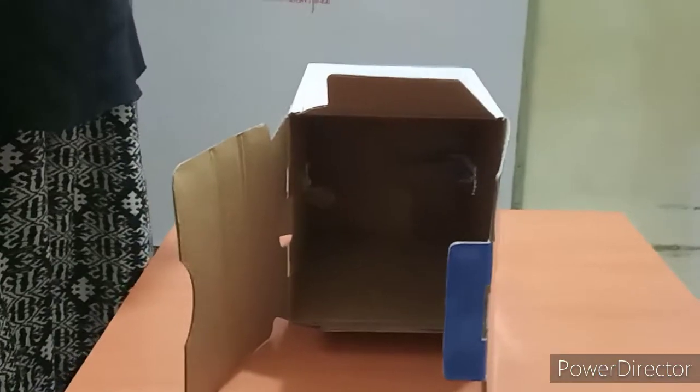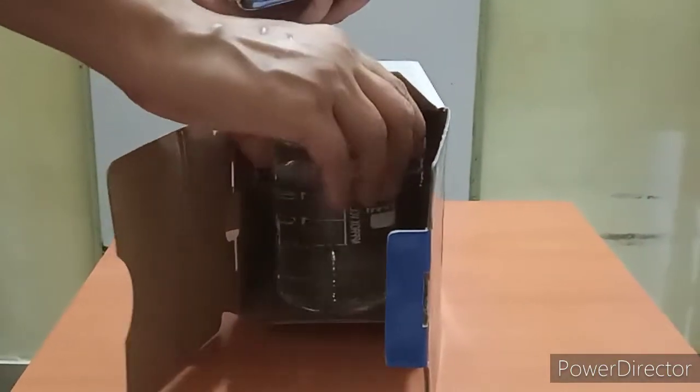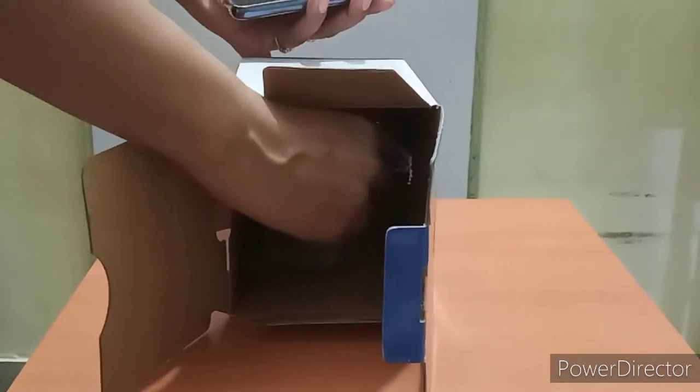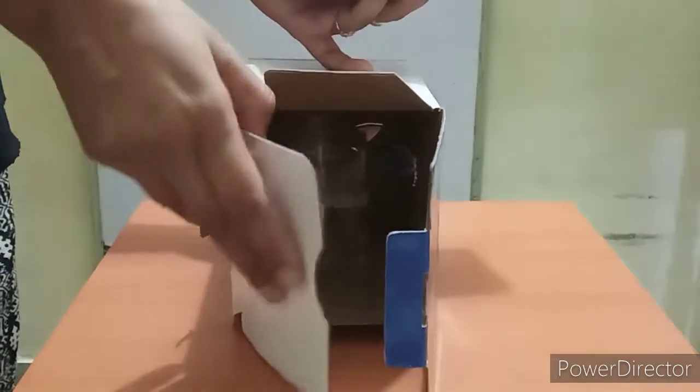First, we are going to perform the experiment with sample A. So we will keep the beaker from the open end in the box, and we are going to close the end so that no light enters the box.